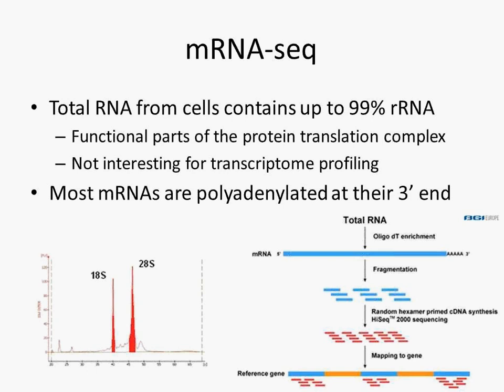nuclease-treated mRNA-seq libraries, where we would not do any oligo-dT enrichment, but would prepare the library from the total RNA, including the ribosomal RNA. Once after reverse transcription, we would denature the library and let it reanneal for 5 hours, which would reanneal all the very repetitive parts of the transcriptome, which is mostly the ribosomal RNAs, and treat them with double-strand specific nuclease after 5 hours, which would separate basically the two adapters from each other by cleaving any very abundant RNA in the sample.